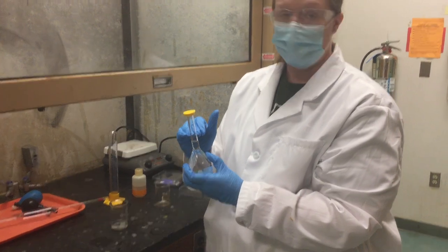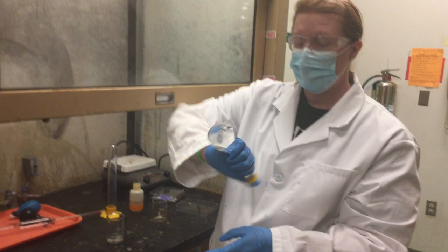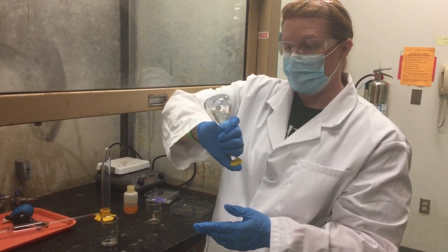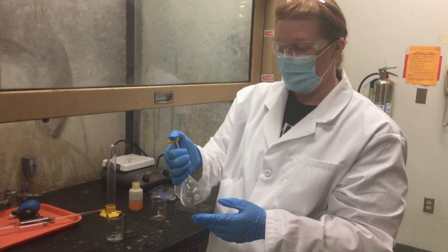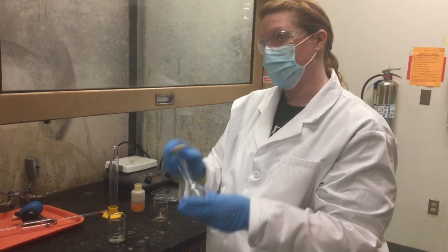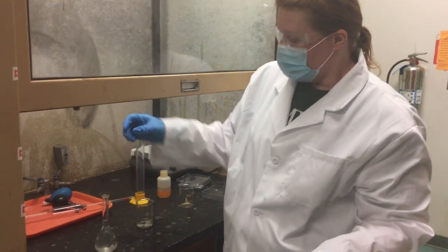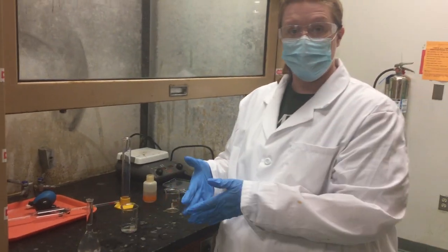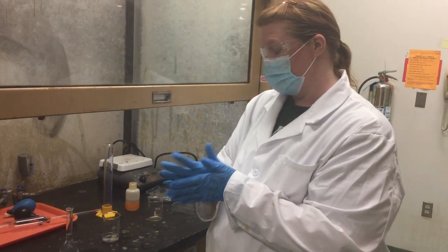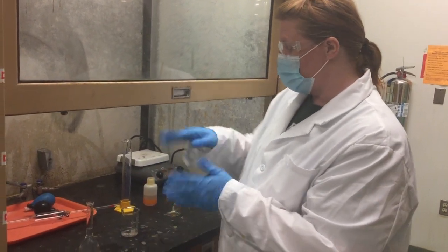Once you've got the dilution up to the line, put the cap on and invert the flask 20 times to mix it thoroughly. If it's not homogeneous when you take your pH, it's going to be wrong. Then take a small portion and put it into a test tube. Make sure you label your test tubes — you're going to get them all mixed up since they're clear, colorless liquids. Label with the molarity and the identity. Then you're going to take the pH of those later.